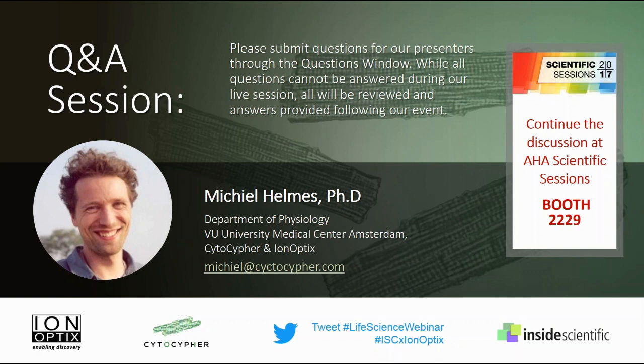Looking to get maybe a couple more questions in here. Can this be used on myocardial tissue to assess contractility on whole tissue or engineered strips? This question comes from Alan York. Yes, there's no reason why not. We didn't design it that way, but if you can move to different wells, you can also move to wells that have engineered heart tissue in them. And even if we don't measure sarcomere length, we also have edge detection, so you can just follow the bending of the pillars. So there's no reason why you wouldn't be able to use it. And you can do fluorescence and contractility at the same time, whatever kind of fluorescence you're interested in. So I would say the answer is unambiguously yes.